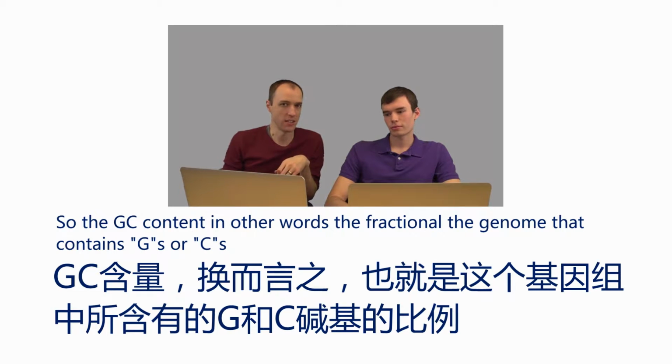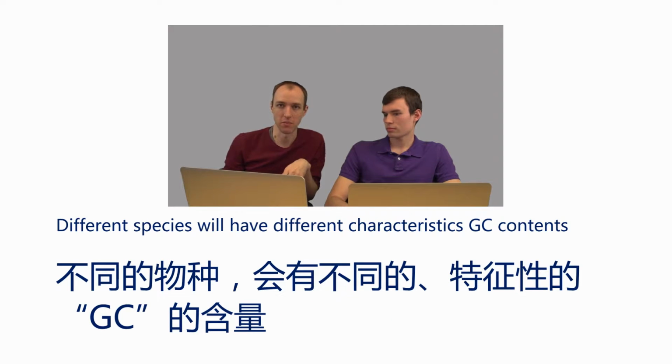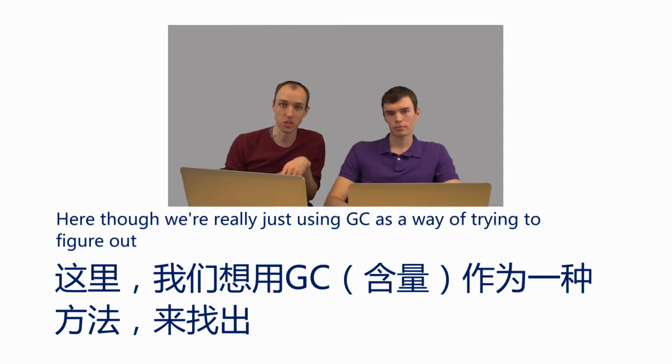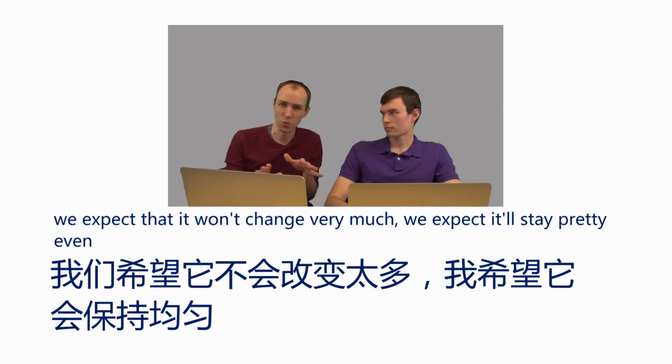So the GC content, in other words, the fraction of the genome that contains Gs or Cs, is something that is different from species to species. Different species will have different characteristic GC contents. Here, though, we're really just using GC as a way of trying to figure out whether the mix of different bases is changing as we move along the read. We expect that it won't change very much. We expect it'll stay pretty even.